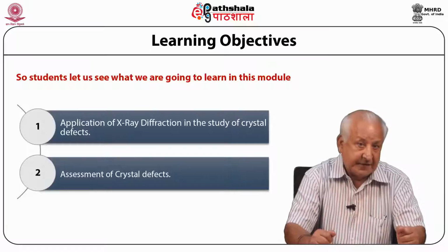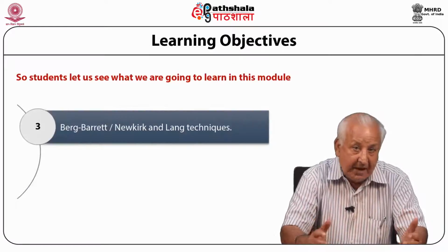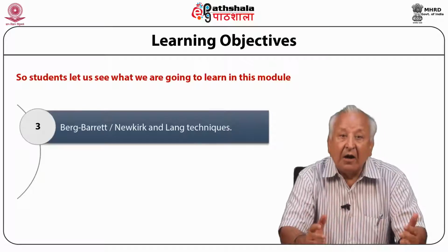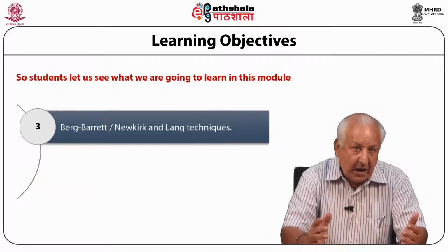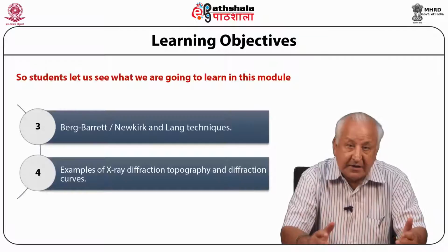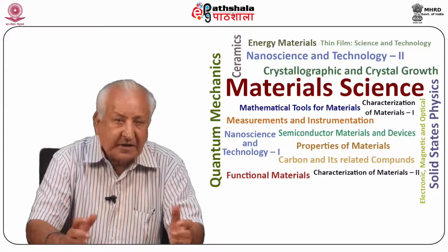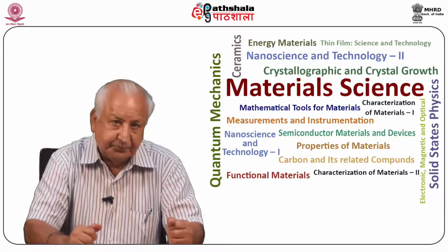assessment of crystal defects, the Berg-Barrett, also known as Newkirk, and Lang techniques, examples of X-ray diffraction topography and diffraction curves. Assessment of crystal defects.